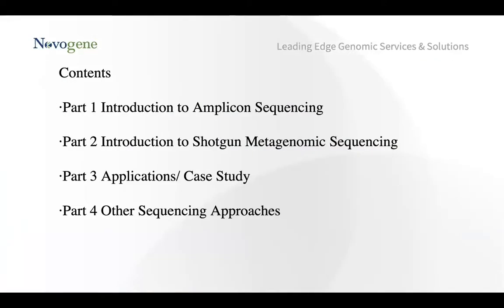I would like to break today's presentation into 4 parts. The first 2 sections are introductions of amplicon metagenomic sequencing and shotgun metagenomic sequencing. Then come the applications and a relevant case study. After that, we will have a light discussion on other sequencing approaches in microbial research.